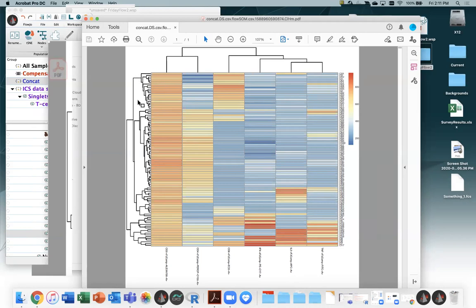So this is perhaps one set of clusters that are all very different from everything else. There's a big long line here, and perhaps within them, this one looks like an outlier. It by itself, there's one row that's very different from everything else, but maybe there's one more group here that is distinct from the others. So maybe that's two and an outlier. Perhaps this is 3, 4, 5, 6, 7, 8, 9, something like that, but we could probably decide that there is a couple, maybe these are too distinct. Maybe we should have 10. All these lines are pretty small once you get past separating out those two.